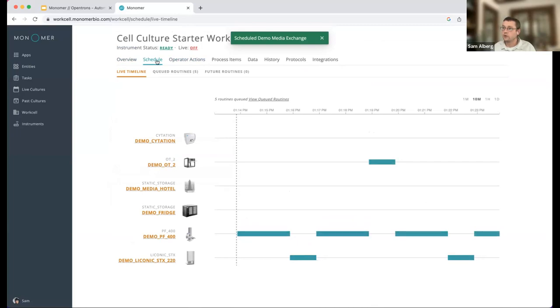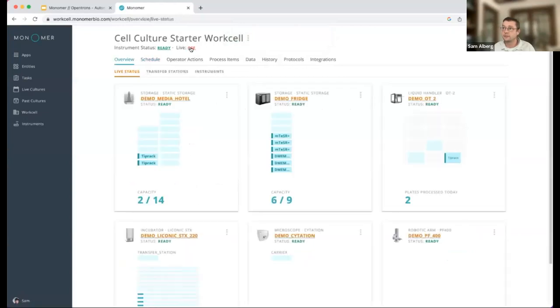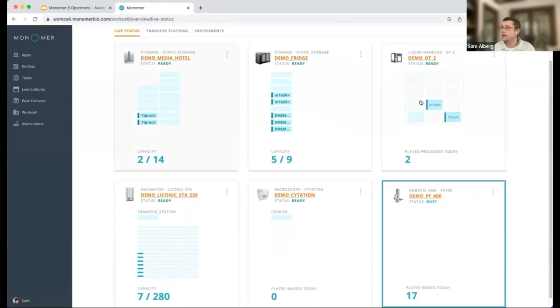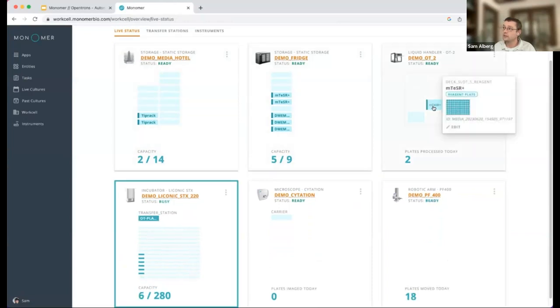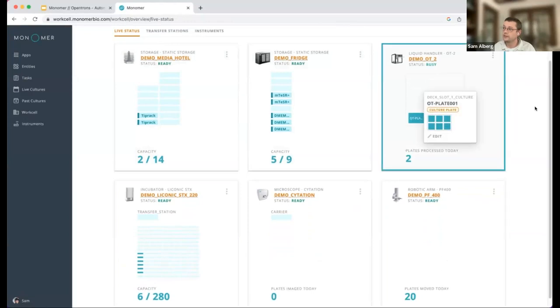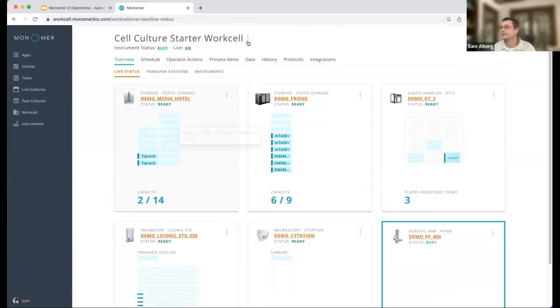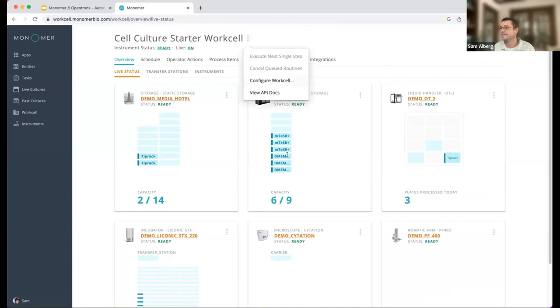Once it's scheduled, from the schedule tab, we have this nice diagram that'll show us what's been scheduled and which instruments will be occupied when. At this point, we could just set the system live. And if we look at this screen, you'll see that this is now animating. We've moved a media plate onto the Opentrons deck. We've now moved our cell plate onto the Opentrons deck, done our exchange, and moved it back to the incubator. It's happening quite quickly, so let me just slow this down.